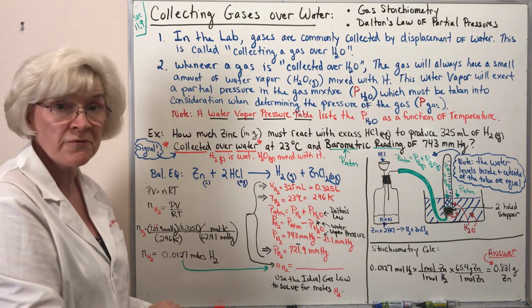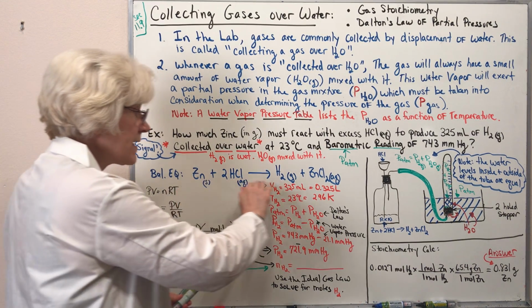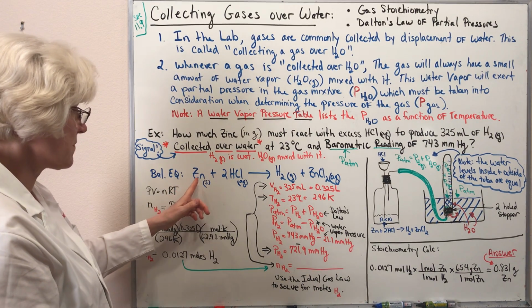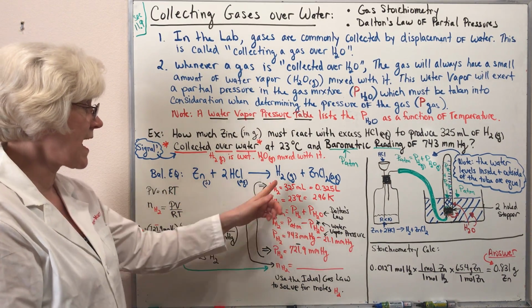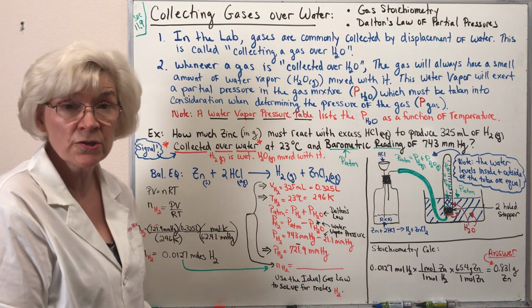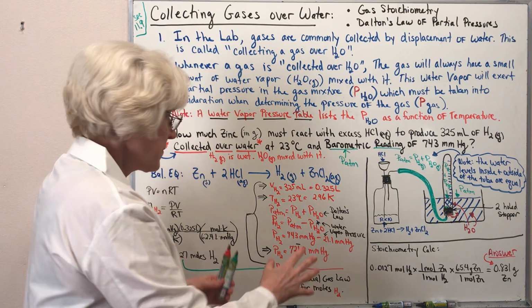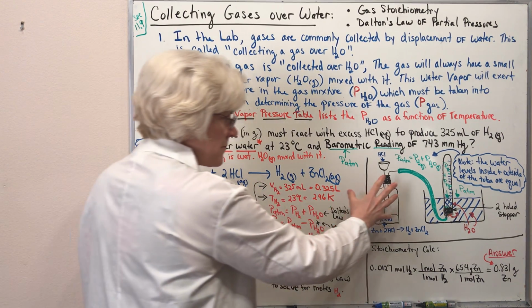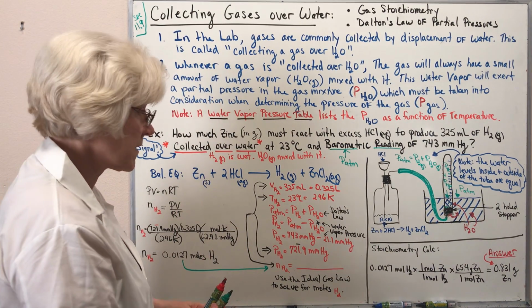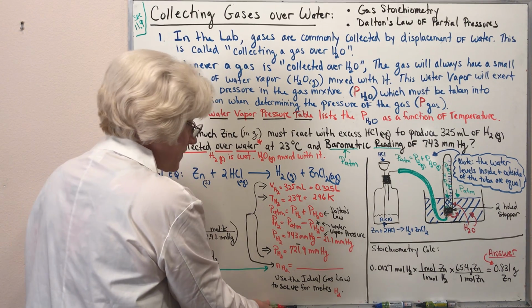We're now quite familiar with single replacement reactions and can easily put down here the single replacement reaction between zinc and hydrochloric acid to generate the hydrogen gas, as well as zinc chloride, which would remain dissolved in solution. Before we go through the calculations, we really need to appreciate the experimental setup for this reaction to understand what we need to do with this data.